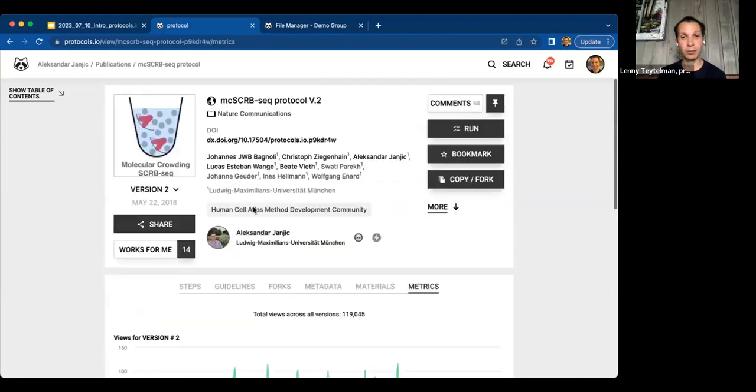And the last thing I wanted to say on the protocol level is that there is a run button that's particularly useful for hands-on techniques. So of the 14,700 methods that I mentioned, I think somewhere around 90 to 95% of them are wet lab methods, 5 to 10% are computational, and you're very welcome. I'm a bioinformatics scientist and experimental scientist.